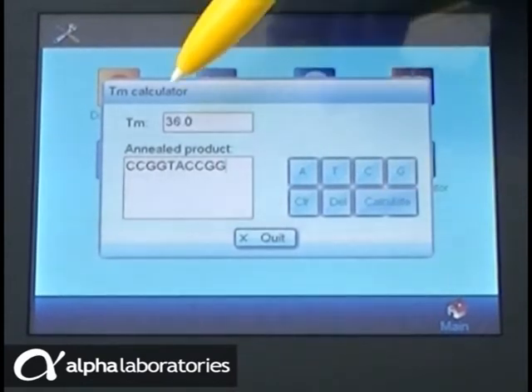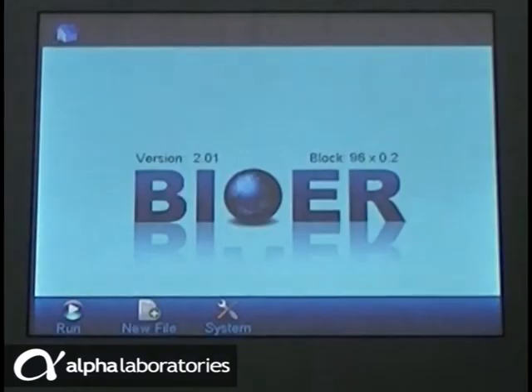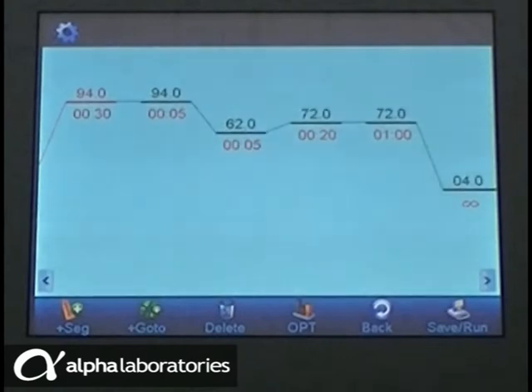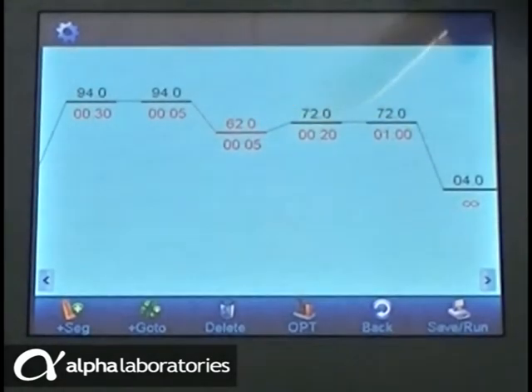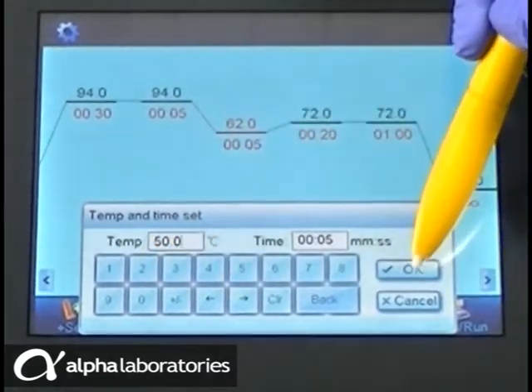Creating a new file is simple. Starting from the pre-programmed standard file, the LifeEco makes it very easy to create your own protocol. Just touch any segment you wish to change and touch again to modify the temperature and time as required.